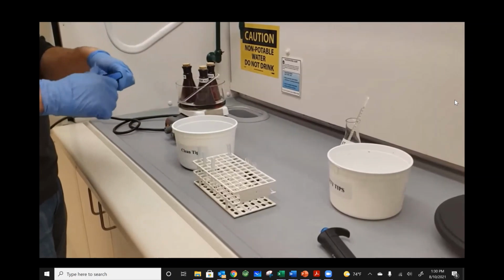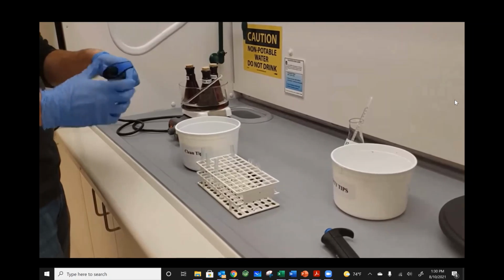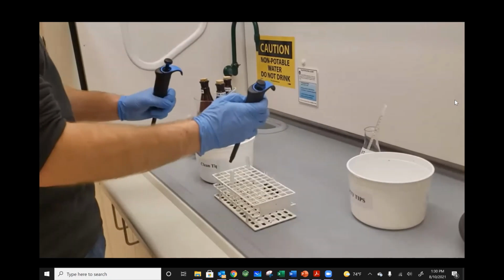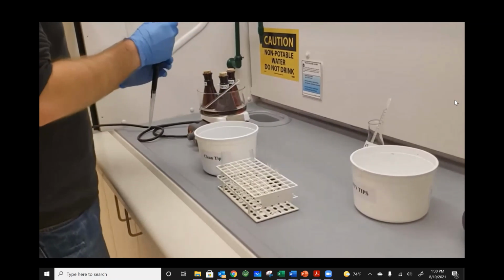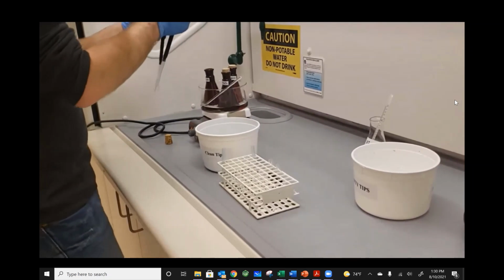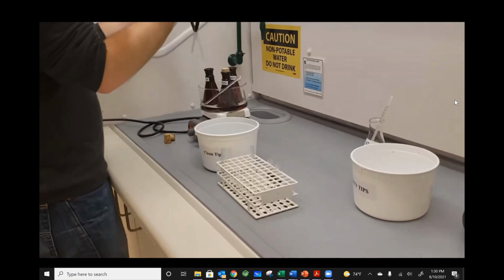Now I need 1,000 microliters of hydroiodic acid solution and 200 microliters of my thiosulfate solution.